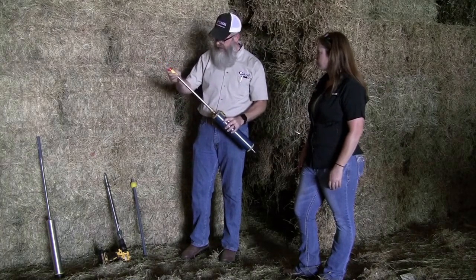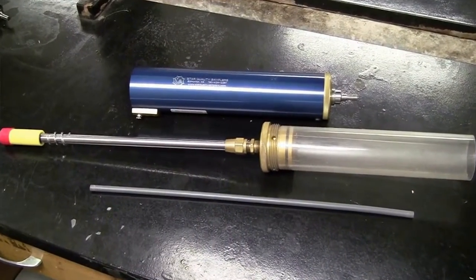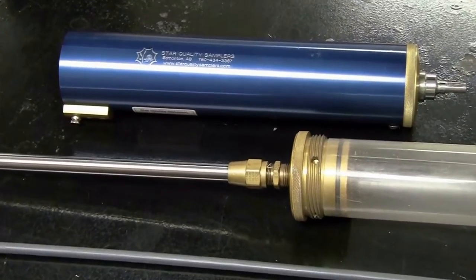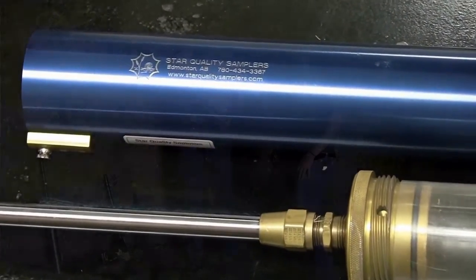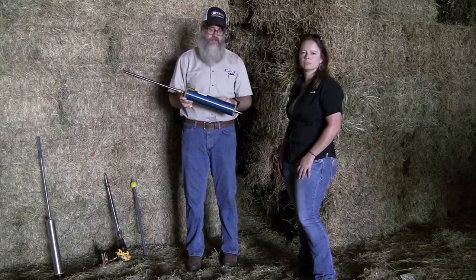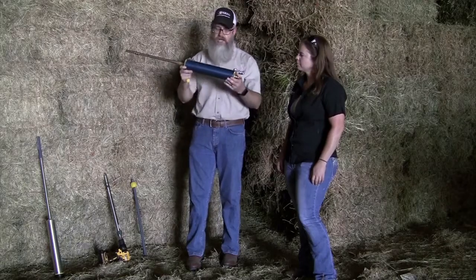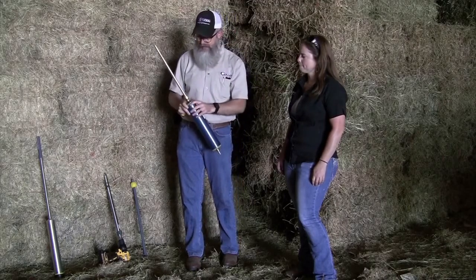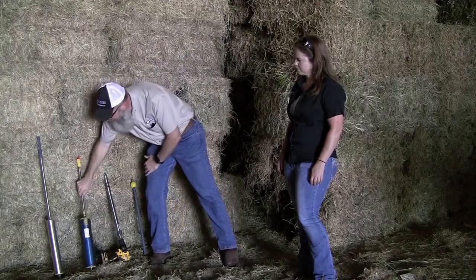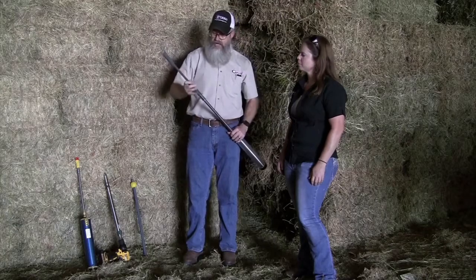So another option, this is actually one that we use a lot of times for research. It's very similar to the Penn State style probe. This is also made by Star Quality Samplers. It also has the flighting on it, but what I like about it is it's got this nice canister. So for research purposes, we do a lot of use of this because we can get a lot of different samples, a lot of different cores into one sample, and then we have it ready just to pour right into the bag.